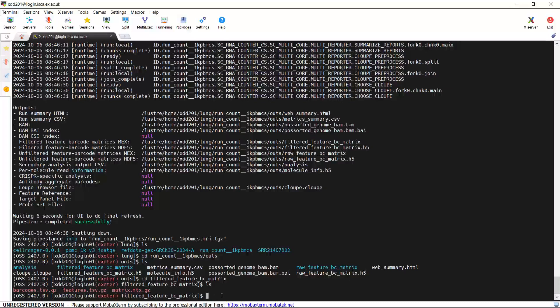That's the demonstration for today. I showed you how to download the demonstration data — the 1K PBMC dataset — and the human reference genome file, then use the Cell Ranger count command to analyze raw single cell RNA sequencing data. You can try to download the data and run the Cell Ranger count command to see if it works for you. Thank you very much for watching my video tutorials.